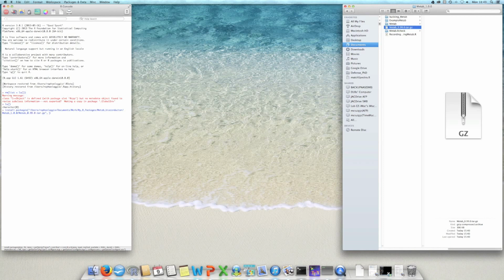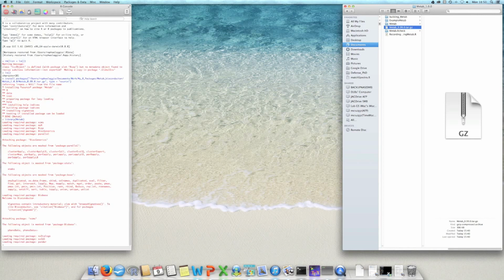And now here I have to put the type of package. In this case, it's a source package. Okay, cool, enter, it's installing Metab. Easy like this. So it's testing, Metab is installed, it's done. Now I'm going to load Metab to see if it's actually working. So I come here, library, Metab. Remember to put M as a capital letter, and enter. It's loading Metab and also all the packages required by Metab. As you can see here, it's loading XCMS, MZR, and all the other packages.